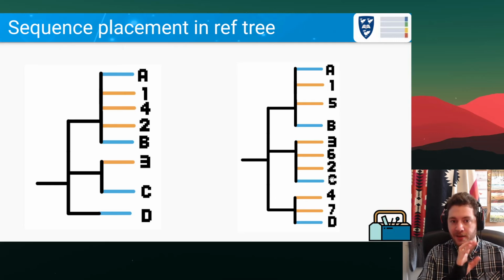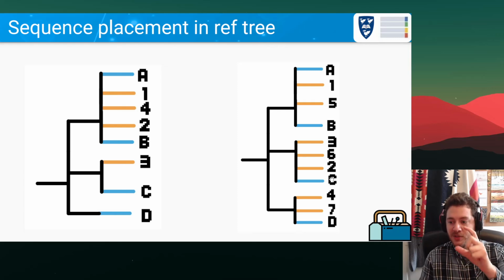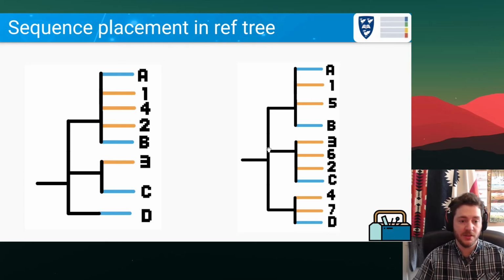It's not a simple matter of that new sequence being added in somewhere, it's the whole tree being reorganized because we have further information. So a tree of 10 different organisms will look very different than a tree of 20 different organisms with those same 10 organisms in there, most likely. So this is one limitation. Depending on the data you input, you might get very different results.